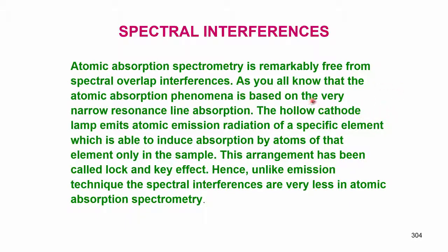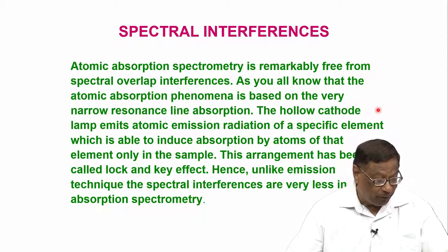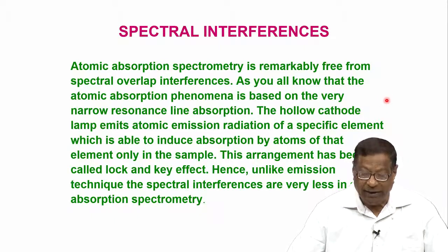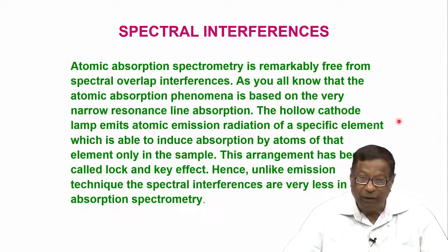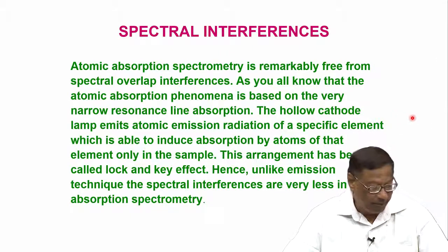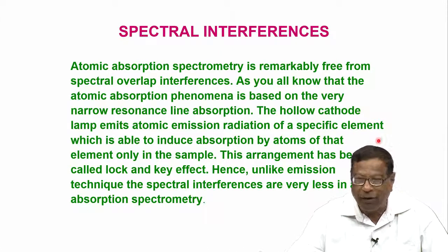We have been discussing atomic absorption and spectral interferences. The resonance lines are most important because AAS is specific for each element due to the resonance line. But sometimes the resonance lines of two different elements are almost similar or exactly match in terms of frequency and wavelength. When they match, the monochromator is not able to distinguish between the two different atoms' resonance lines, resulting in enhancement of the signal.